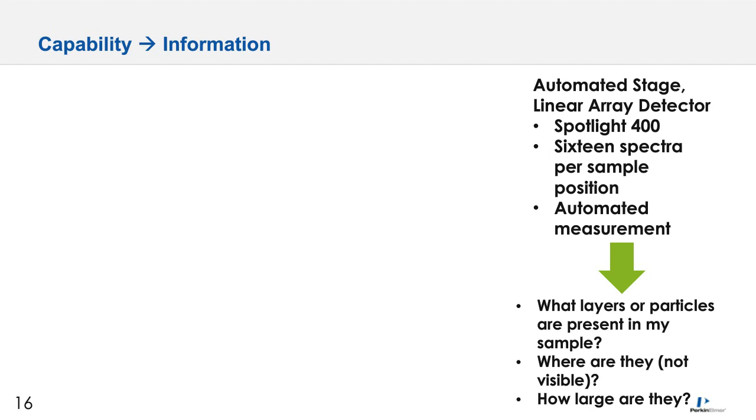This can also provide an analysis in a sort of dragnet fashion, where the user needs no prior knowledge of sample composition or chemistry, and regions of interest don't need to be visually distinguishable.